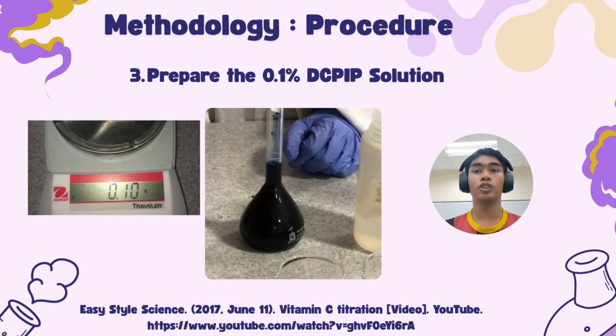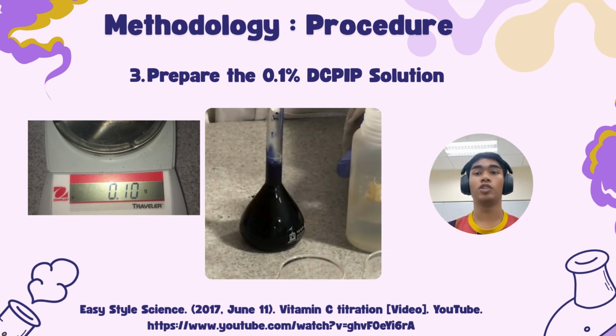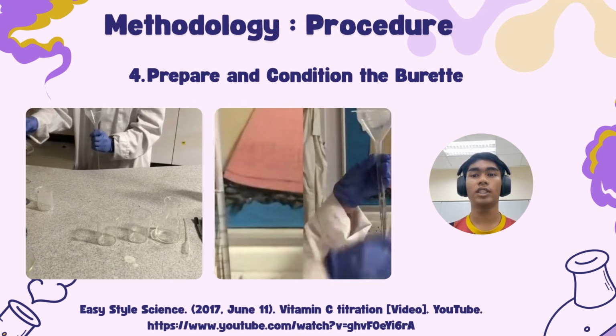To prepare the 0.1% DCPIP solution, first weigh out 0.1 gram of DCPIP. Add a small amount of distilled water to the DCPIP in a 100 ml beaker to begin the dissolving process. Transfer this to a 100 ml volumetric flask and fill with distilled water up to the graduation mark. After that, we need to prepare and condition the burette.